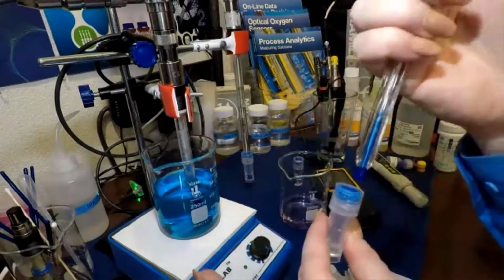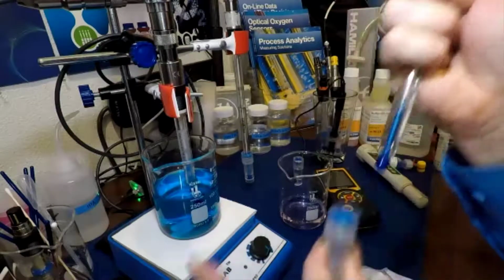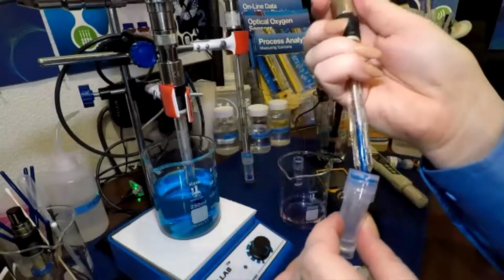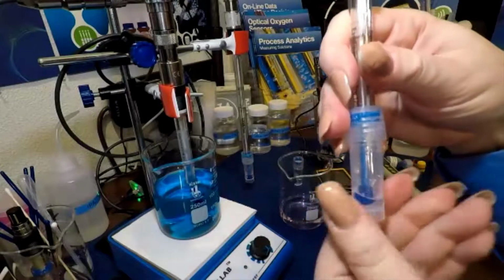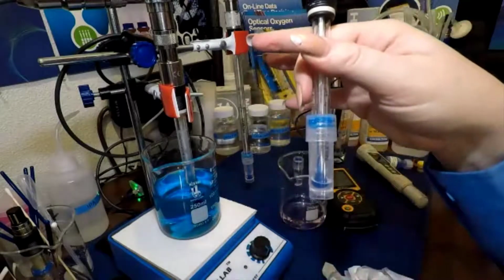On the same side, you shouldn't try and push it in here. If the cap's too tight because it's pressurized, unscrew the cap so it's nice and loose and slide your probe in, lift it up so it's not on the bottom, and there you go.